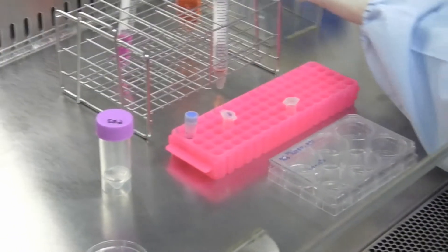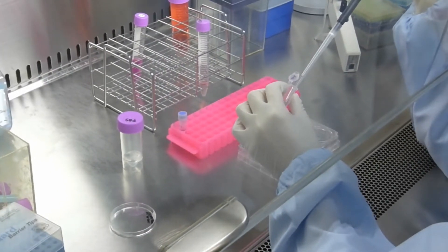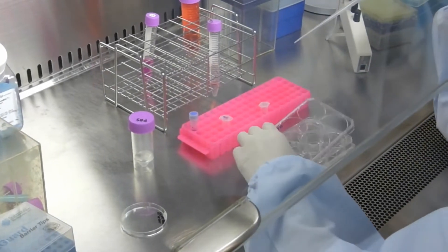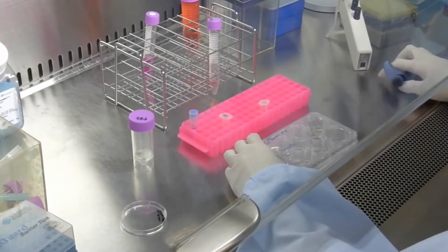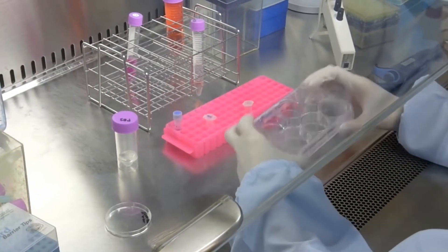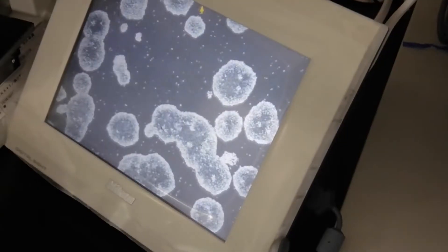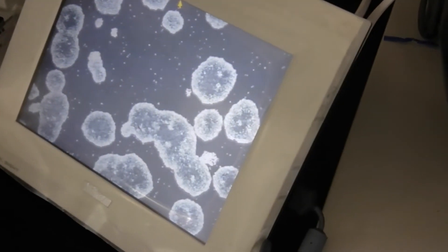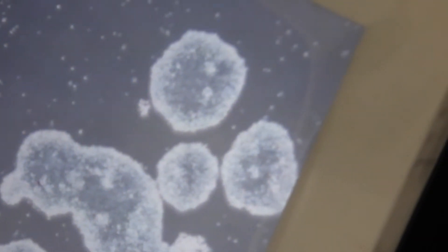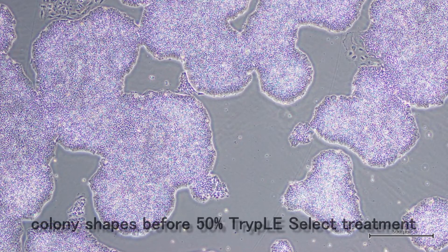Add 300 microliters of 50% TrypLE Select solution and spread it on the well surface. Transfer the 6-well plate into a 37°C, 5% CO2 incubator. After 1 minute, take the plate from the incubator, spread the 50% TrypLE Select solution throughout the well surface again, and return it to the incubator.